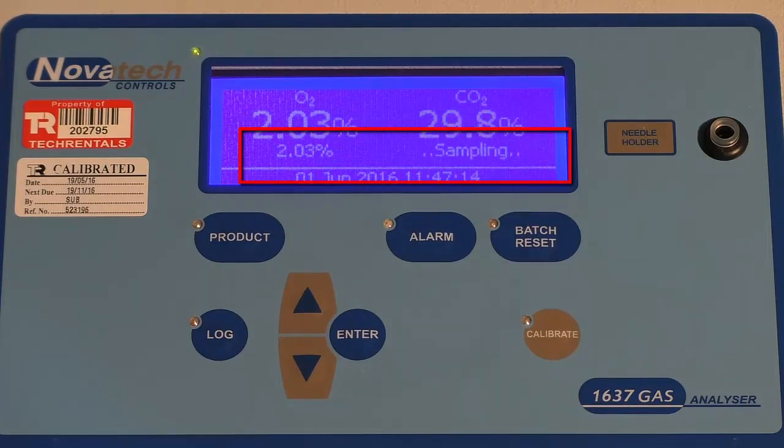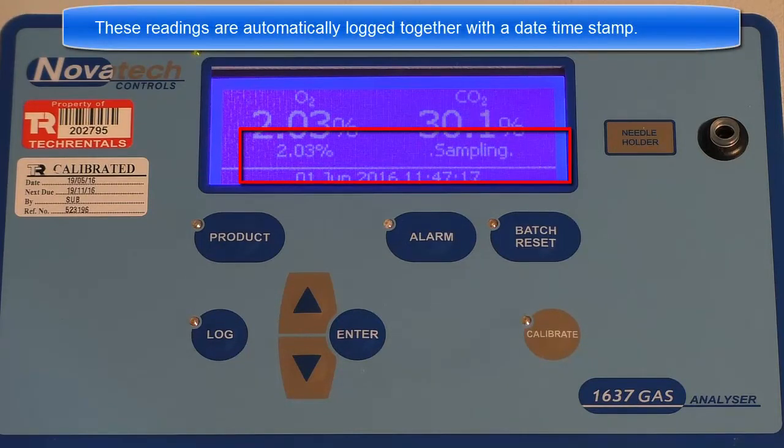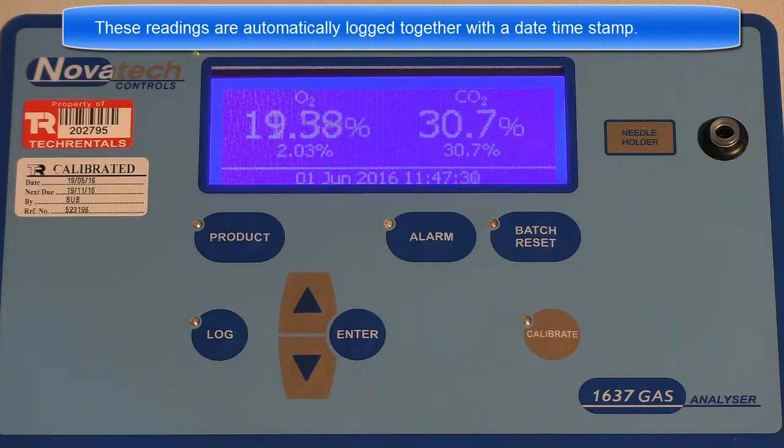Once the reading has stabilised, the word 'sampling' is replaced with 'sample'. Once both readings have stabilised, you may hear two short clicks to indicate that you can remove the needle from the package.